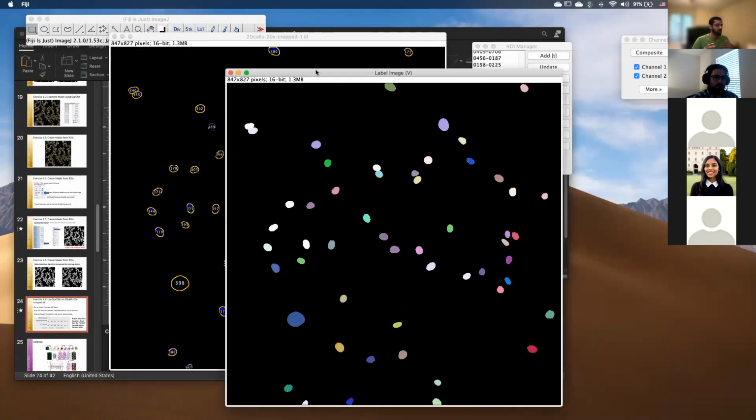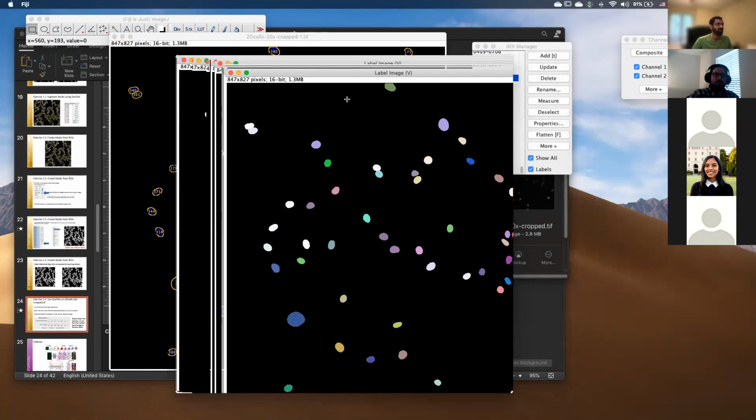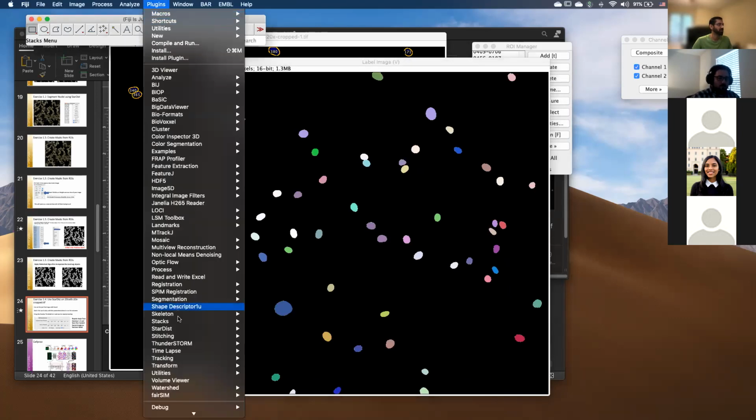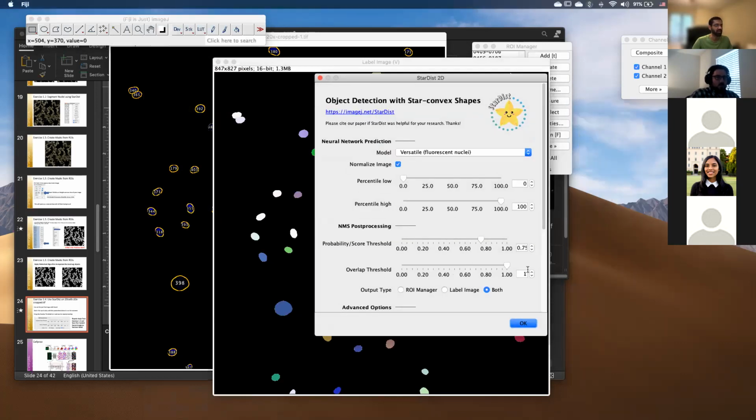It's easy to miss on this if you do not read the documentation properly, okay? So I just wanted to highlight this, and this is where playing with the parameters that you have in this toolbox is kind of important, so that you do not have highly overlapping parameters, okay?